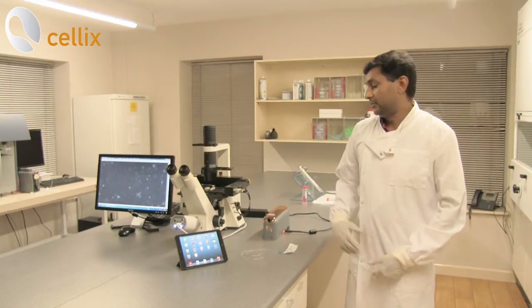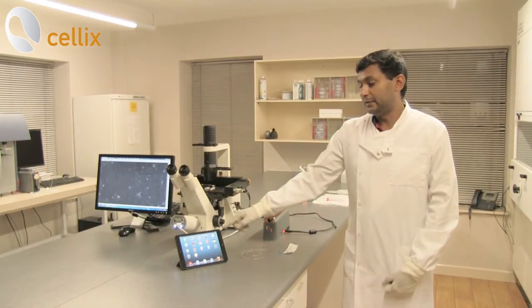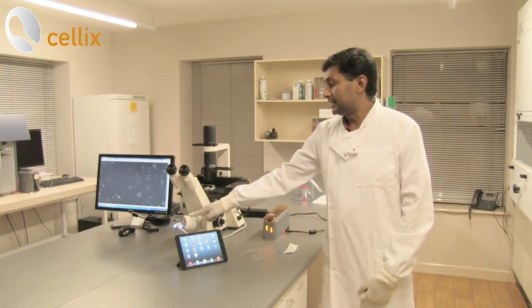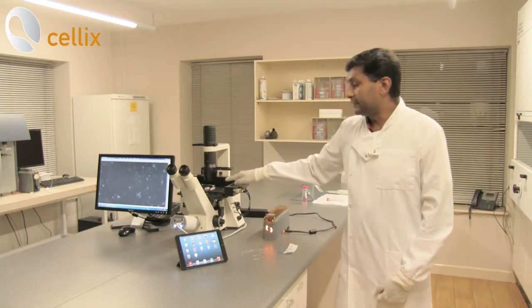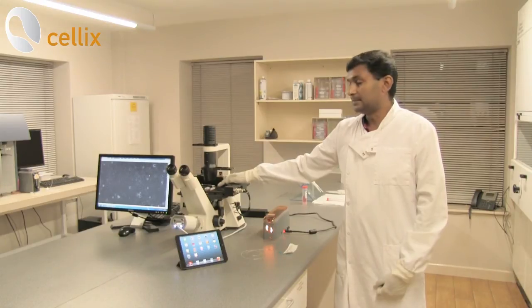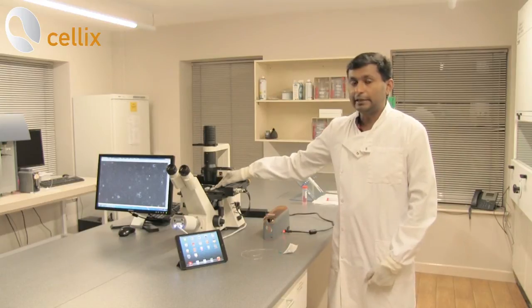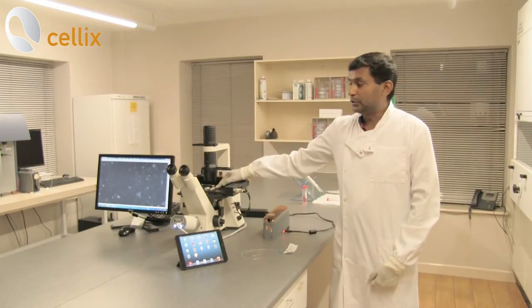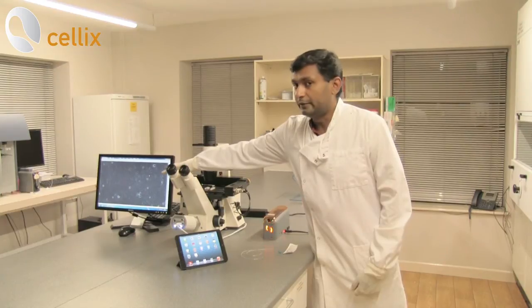As in the previous session you can see the ExiGo pump, the iPad mini which controls the ExiGo pump, the biochip, the camera which acquires the images, and you can see the live image of the chip. The only difference here is the chip we are using is to culture the endothelial cells. In this experiment we are using the Vena9 Endothelial+ biochip where we have seeded the cells and it's incubated for two hours. You can see the live image of the monolayer of endothelial cells.